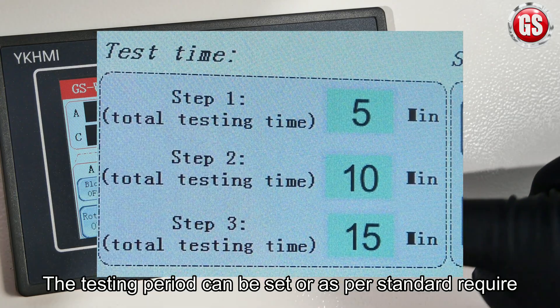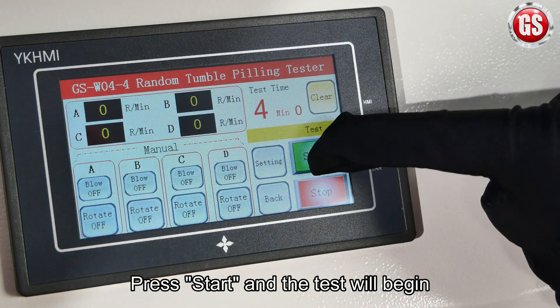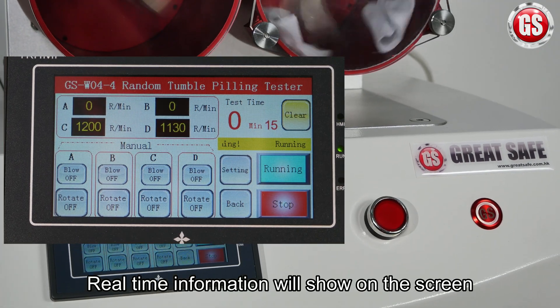The testing period can be set as per standards required. Press start and the test will begin. Real-time information will show on the screen.